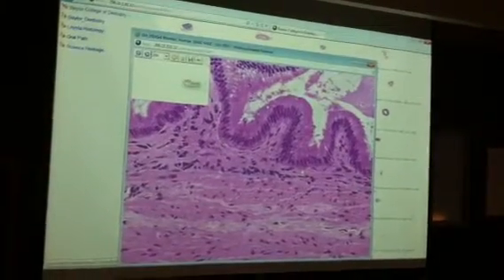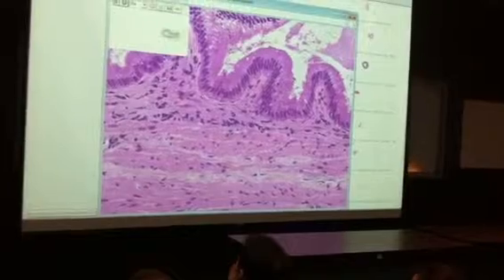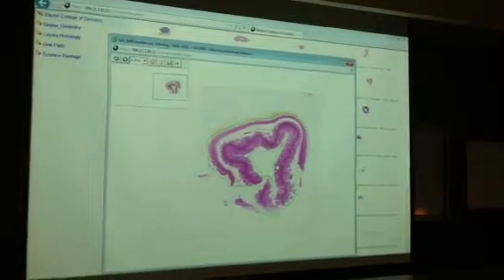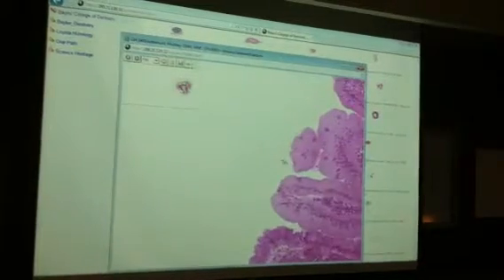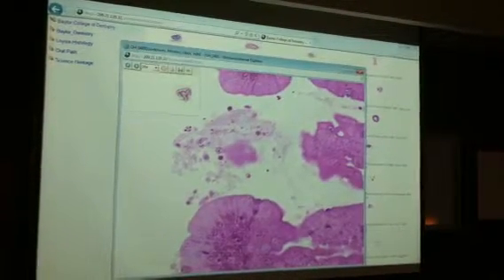Any questions? Any other thing I didn't go over? Anything I need to go over? Anything you didn't understand? Would you point to the brush border? The brush border means I got to pull up a different slide. Yes, sir, I will. Brush border just basically represents the pattern that you see from the epithelia, because of the microvilli on their surface.